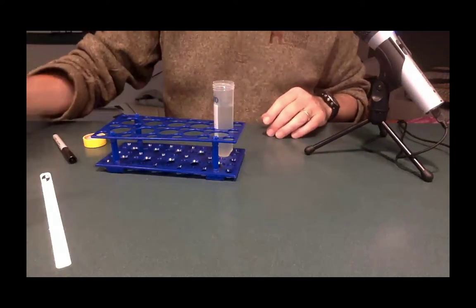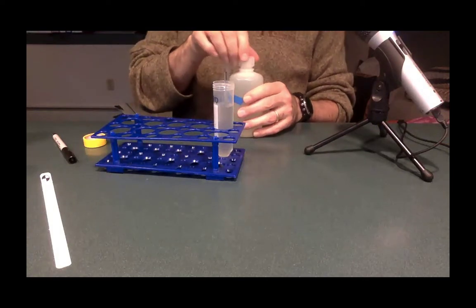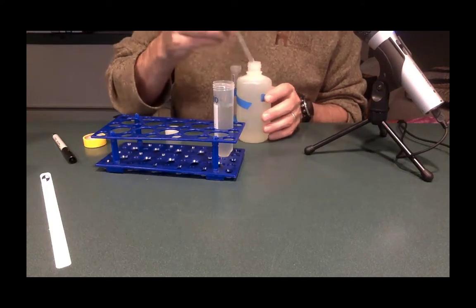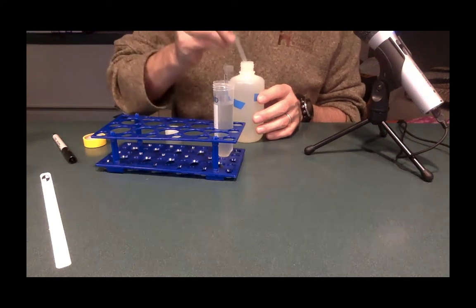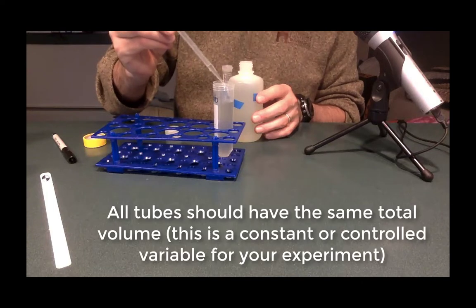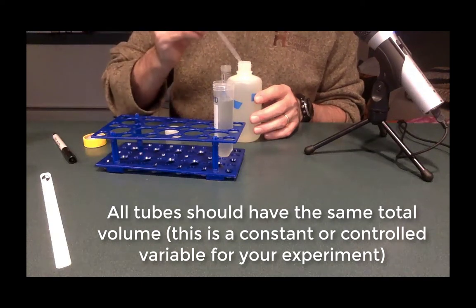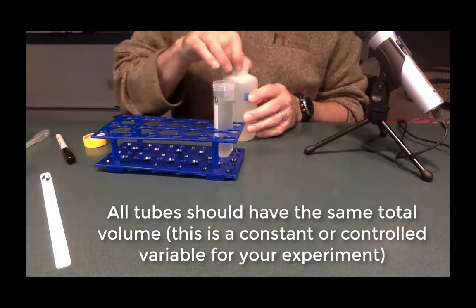And I have decided that in this setup, I'm going to add some amount of fertilizer. And again, that's what I've done. Now, if I'm setting up a control that does not have fertilizer, I am going to want to replace this amount with salt water. So my control might have salt water in it instead of this fertilizer, so that my volumes and dilutions will be appropriate. So I want all my tubes to have the same total volume.